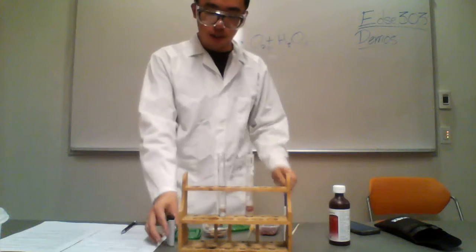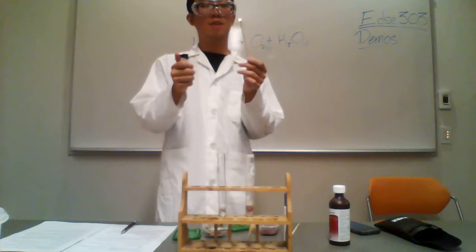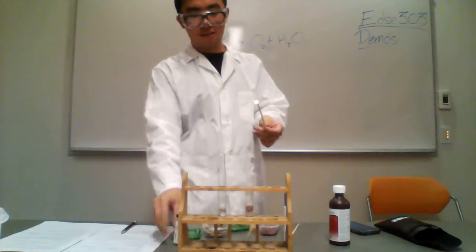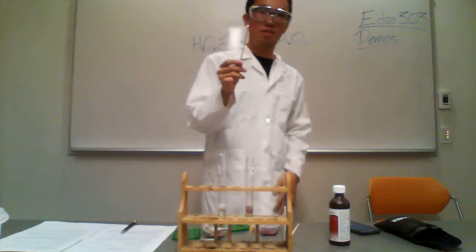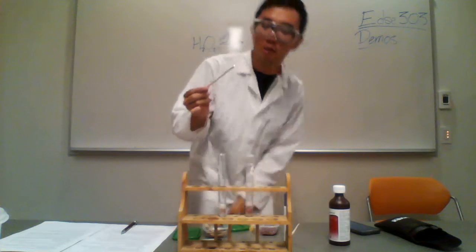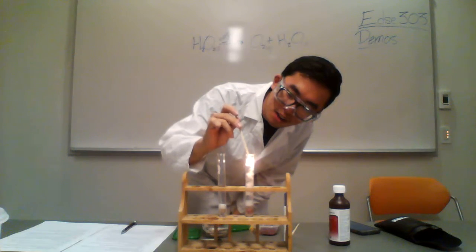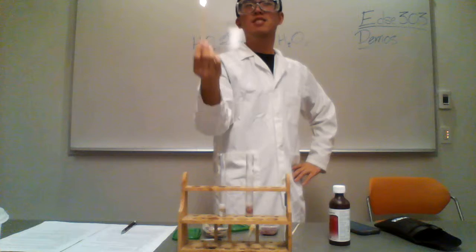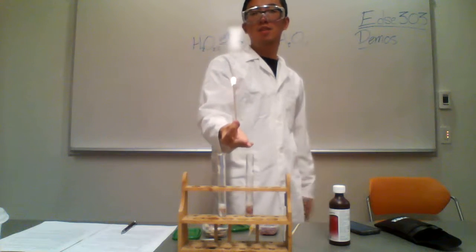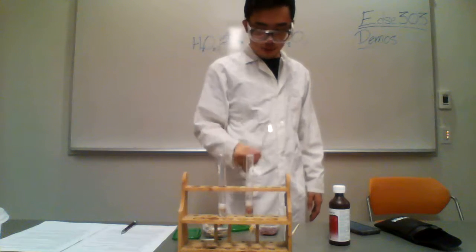Exactly. So what do you think will happen if I light this and stick it in this very messy tube? The bubbles will burn? Well, hopefully the bubbles will pop. Hopefully the bubbles will burn. But there we go. See, look, it reignited, which is obviously a sign of what in the test tube? Oxygen? Exactly. Let's hope Eka does not burn down now.